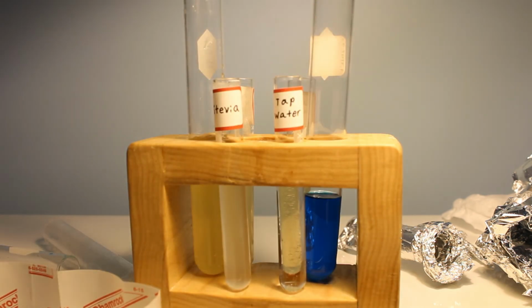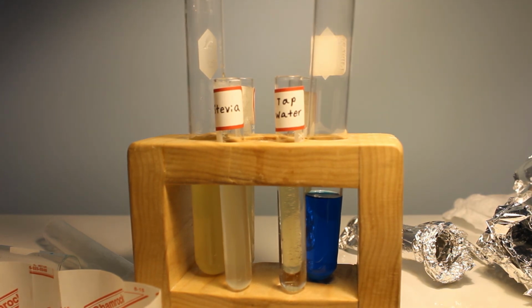I'm going to wash a little pipette so that it's good, and we're going to start testing everything. Obviously outside, because, wait, no, it's not obvious. I'm just going to use water or something.